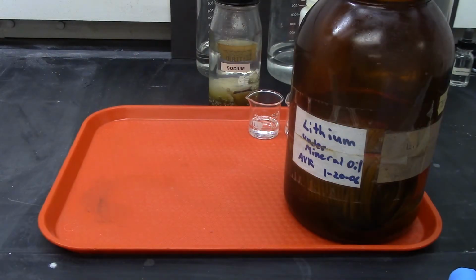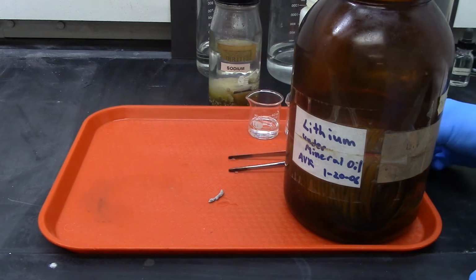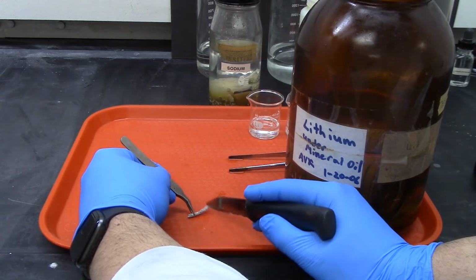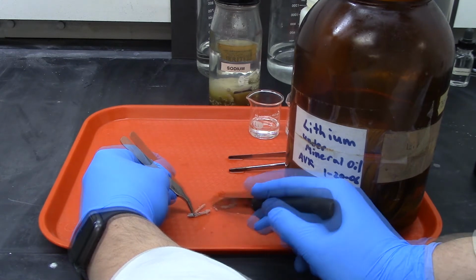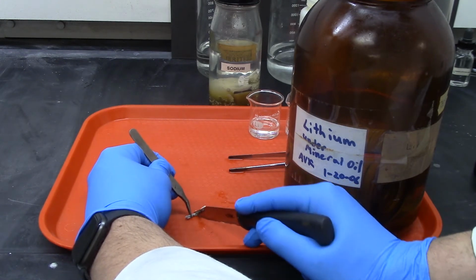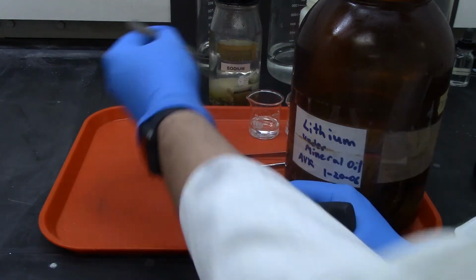Alkali metals react so violently with water that it can actually pull water out of the air and react with it if you leave it sitting out. So typically this is stored under mineral oil, kerosene, or something else. This lithium here had a little bit of oxide that had formed on the surface, so I scraped it off with a knife and then cut it into a small piece and placed it into toluene for use later.